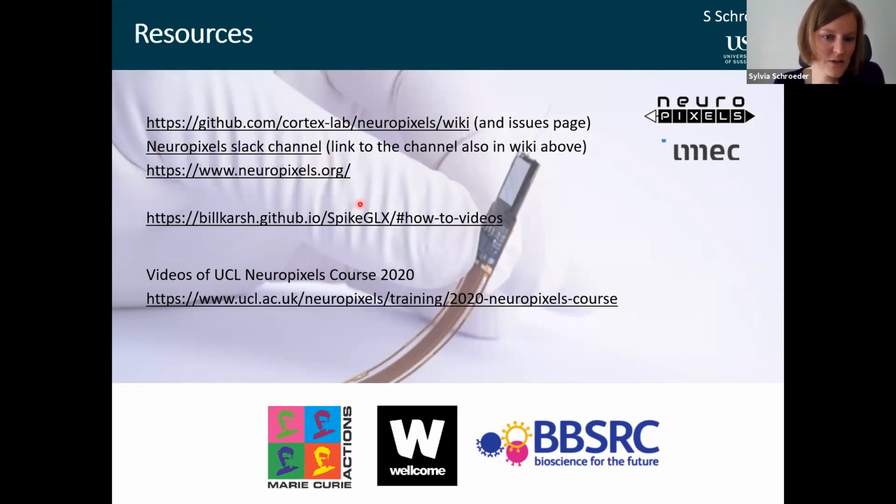I have not at all talked about SpikeGLX, which is a software used to record the data, and it was specifically developed to record data from Neuropixels. And all the videos I mentioned on YouTube, you can find here. So they were all recorded during the UCL Neuropixels course 2020. So I recommend you check this out.